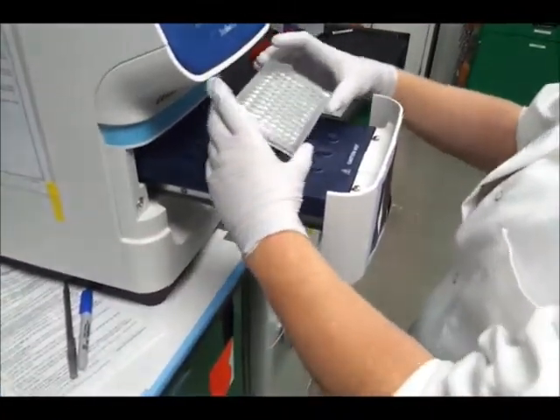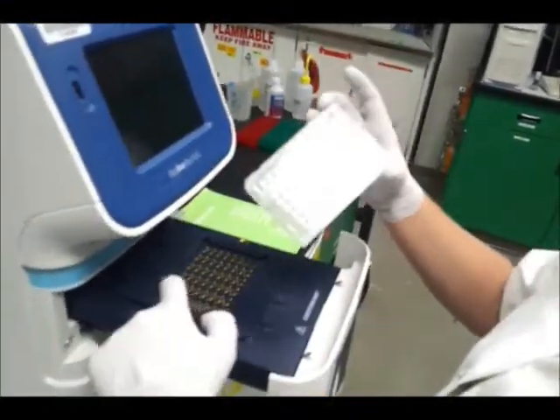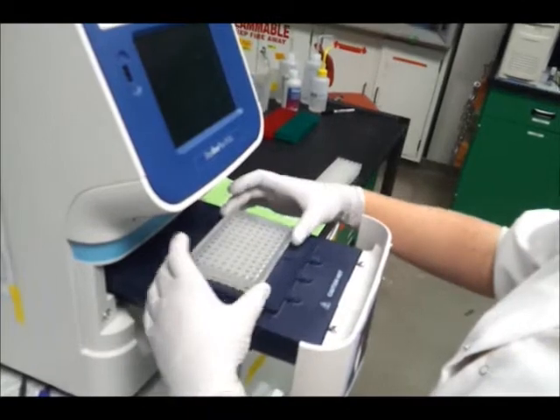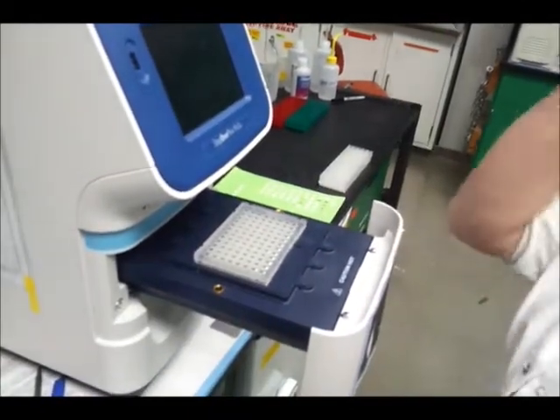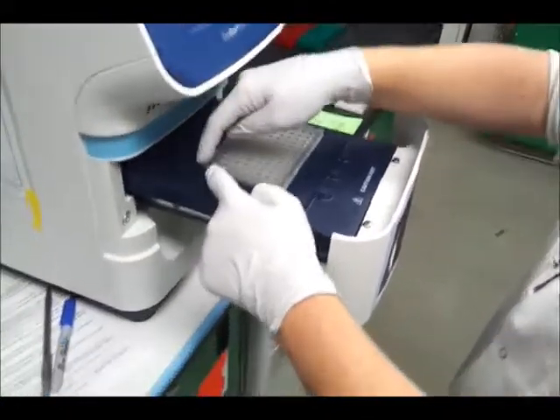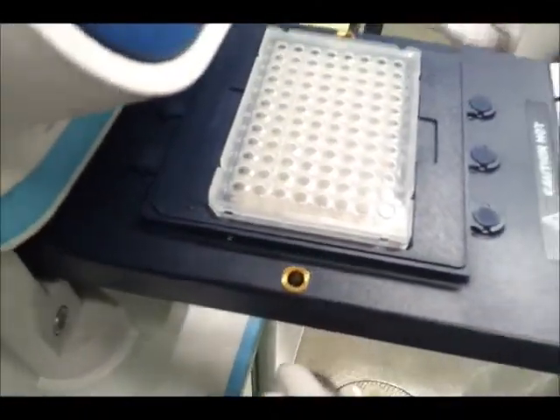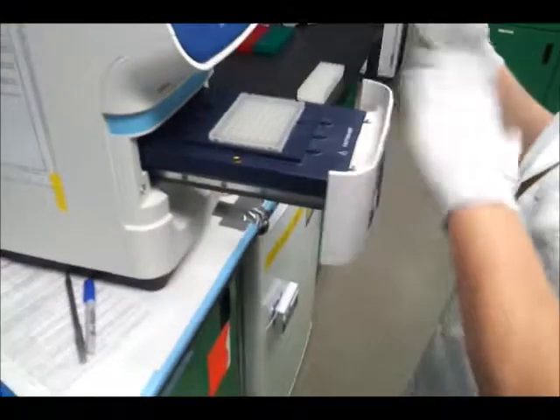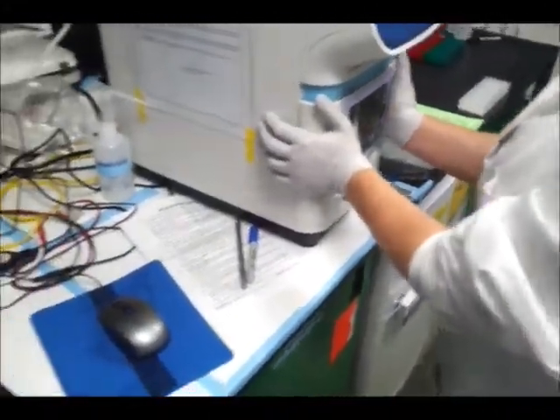Put this guy in. You have to make sure that you are corresponding the A through H and the 1 through 12 in the proper orientation, because if you put it in the wrong way, obviously it's reading the wrong samples. I think the edge of this plate is in such a way that if you tried to put it here, you would know that you were putting it in the wrong orientation, but just always quadruple check that. Close this drawer, and then you basically press on the top right here, start run.